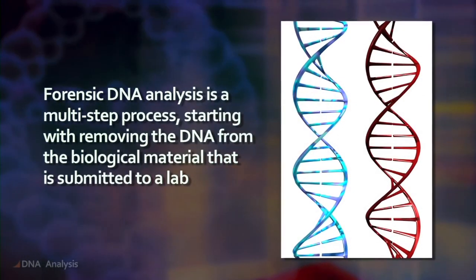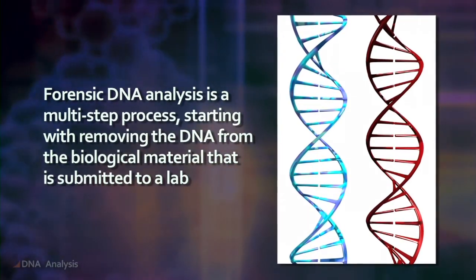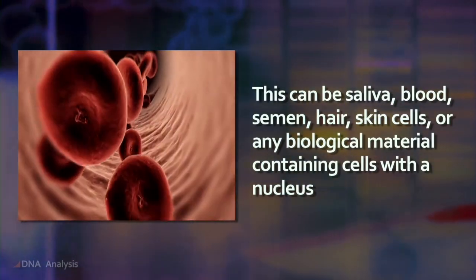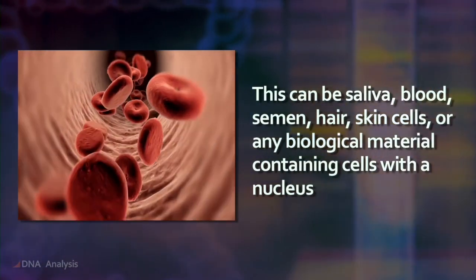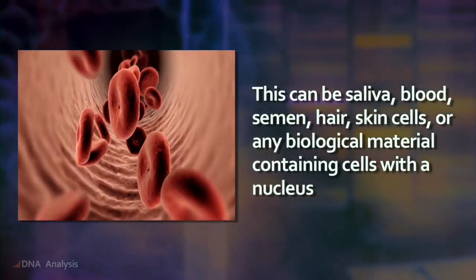Forensic DNA analysis is a multi-step process, starting with removing the DNA from the biological material that is submitted to a lab. This can be saliva, blood, semen, hair, skin cells, or any biological material containing cells with a nucleus.